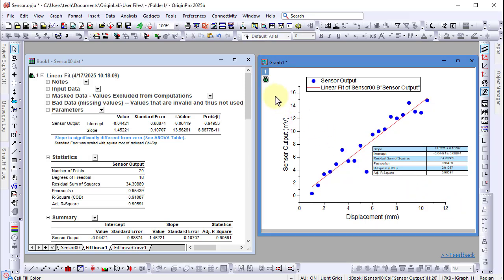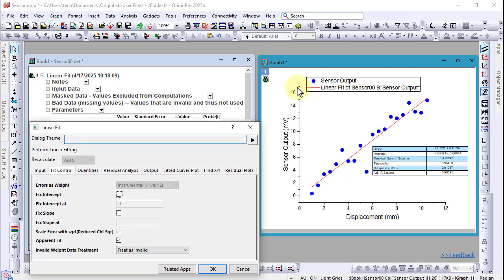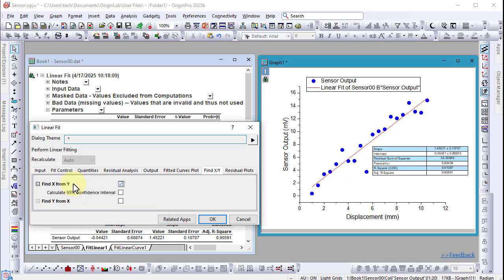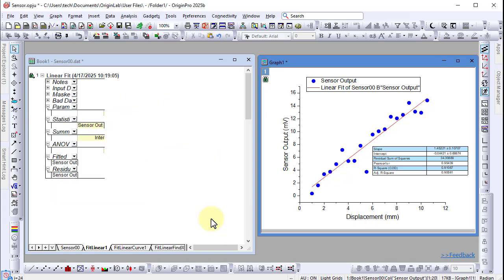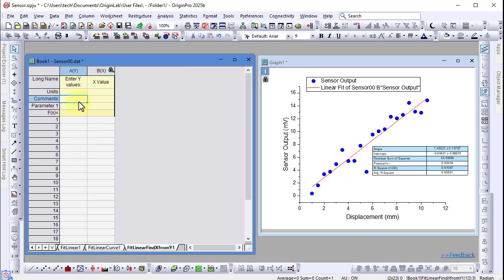By clicking on the green lock icon that indicates recalculation, I can select change parameters or simply use the hotkey Control+F10. For example, if we want to calculate the x values based on the fitted y values, we can make these changes to the settings of our linear fit. Then go to the new worksheet that appears and enter y values in column A, which will get the corresponding x values in column B.